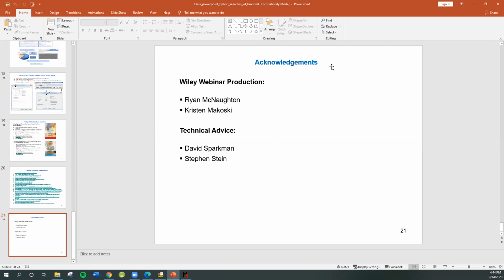It doesn't have a pull-down for the tandem libraries. There are some ways to do it, and it works on some and not on the others. So we need to do a little bit more work, I think, in making that a little easier to use. I think Wiley could make theirs into a tandem pretty easily. And the search that I showed you with the funnel works on certain tags, so it's good to use the tags. They need to put some tags in that make it easier to do the hybrid search. But that's all doable, so I think that'll change. And then, of course, the user libraries are another issue too. You'll have to make sure that you create them in the correct format.